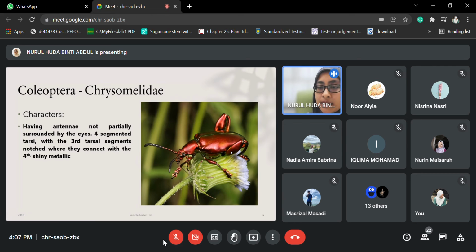is actually contradictory. You may describe that, if you see here, the head is actually smaller than the thorax. You can describe that as well, because sometimes there are beetles that have a very large head compared to their thorax or prothorax. Here it is the prothorax. The one you see here is the prothorax, because the meso- and metathorax are underneath the wing, since the wing sits on the meso- and metathorax.